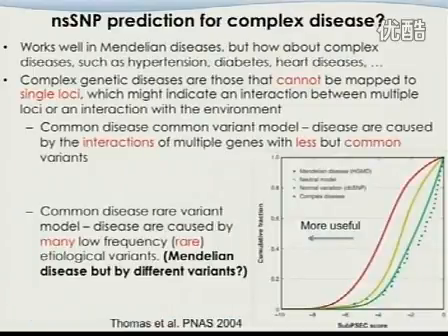Are we okay with the non-synonymous variations? So basically, there's a lot of words in these slides, but there are some key points that I want you to understand. Most of these non-synonymous variation predictions are based on one important assumption: that evolutionarily conserved regions shouldn't be messed up. If they are, you will get into trouble. That is their basic assumption.